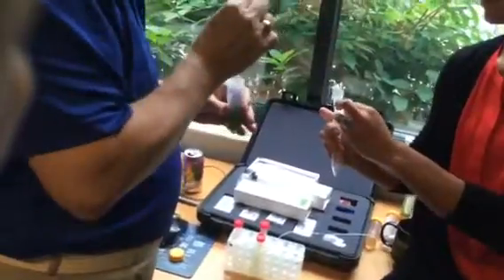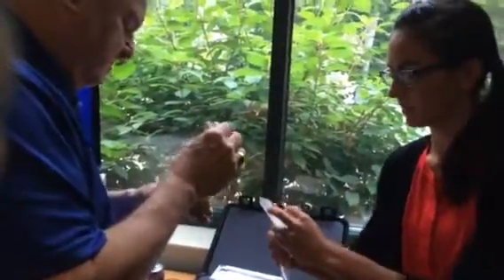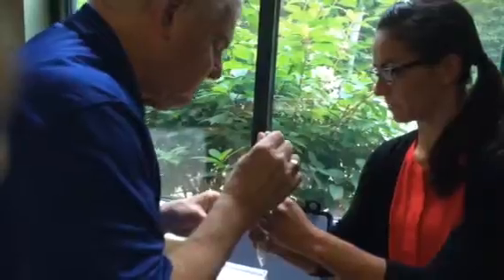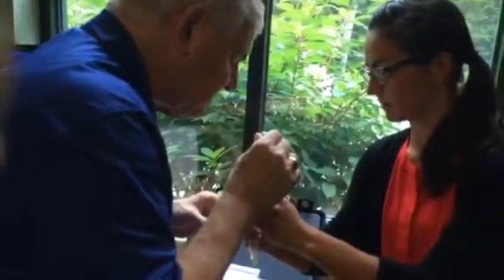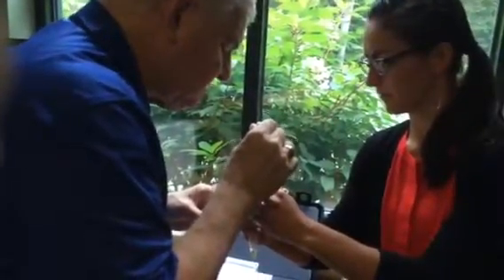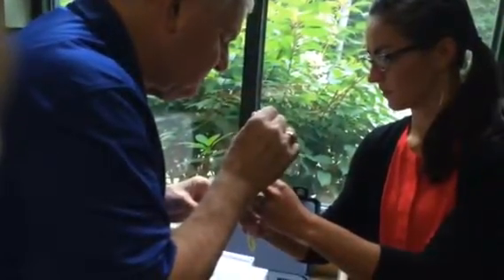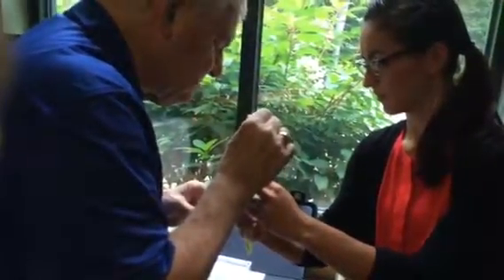I'm going to squeeze it first before we put it in. We do not want to add air bubbles. Good. The first time you put it in, you might have to push it through a little bit because of the water tension. It's going through. So let's do a couple more of those.